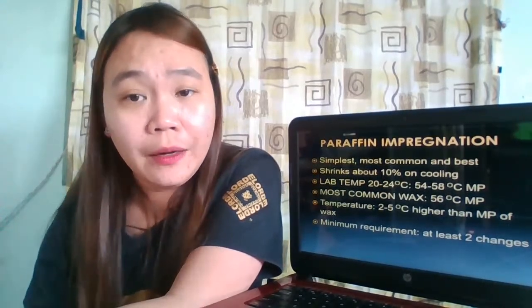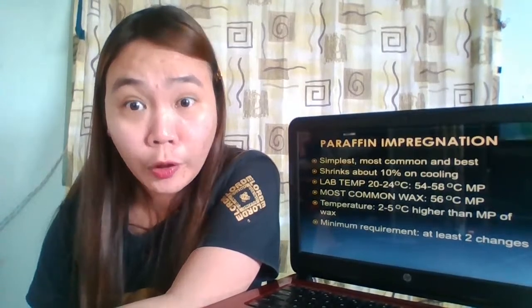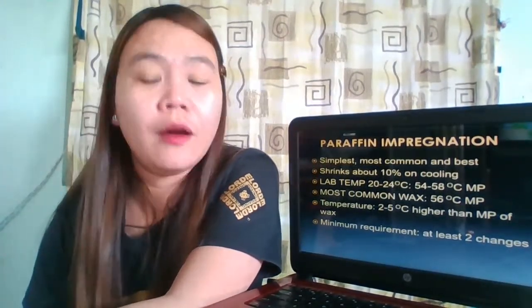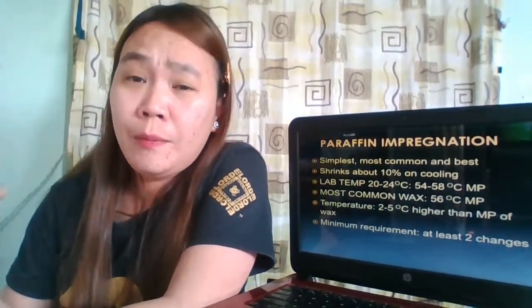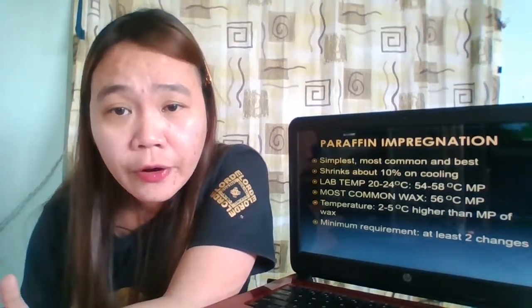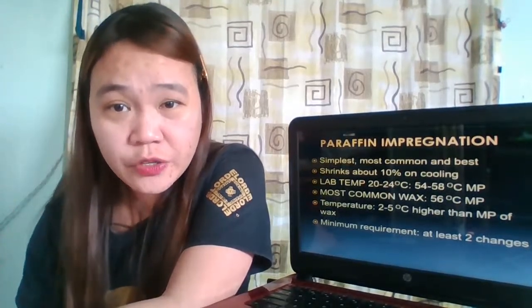Now, why do we impregnate and embed? We impregnate and embed in preparation for sectioning.